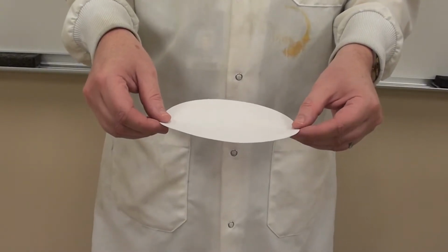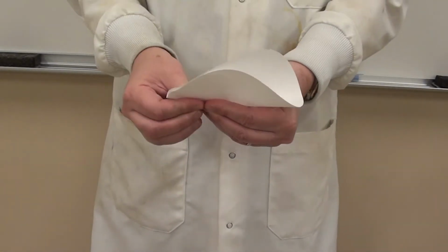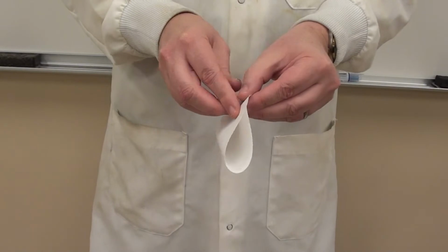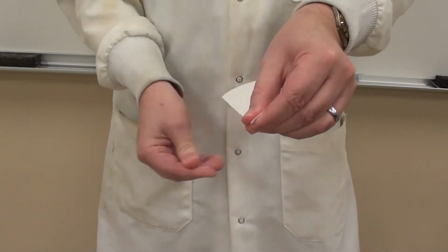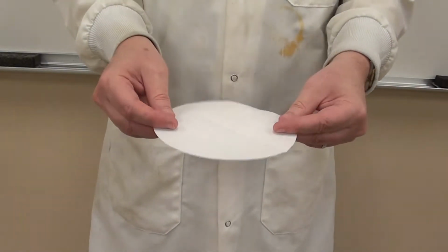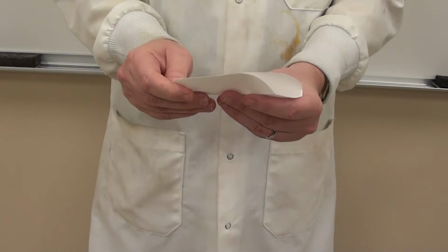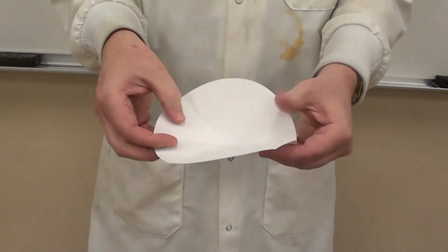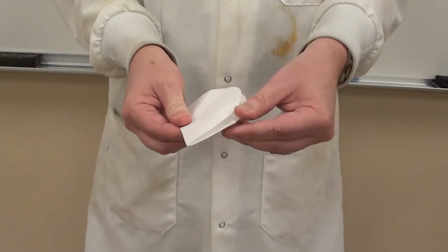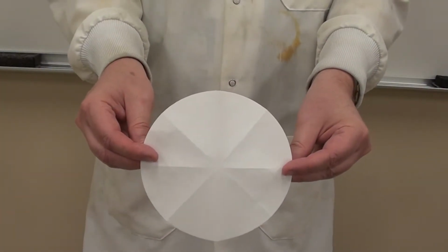So this is how you flute a filter paper. What you'll do is fold it in half, and you will open it up and then fold it in half again. Miranda, let me know if I go out of the shot, okay? Please, thanks. And then you'll open it up and fold it in half again. The idea is to get 8 equal sectors. So opening it up and fold it in half again. What you can see is all of these creases are pointing to the inside, and then when we turn it over, of course, to the outside.